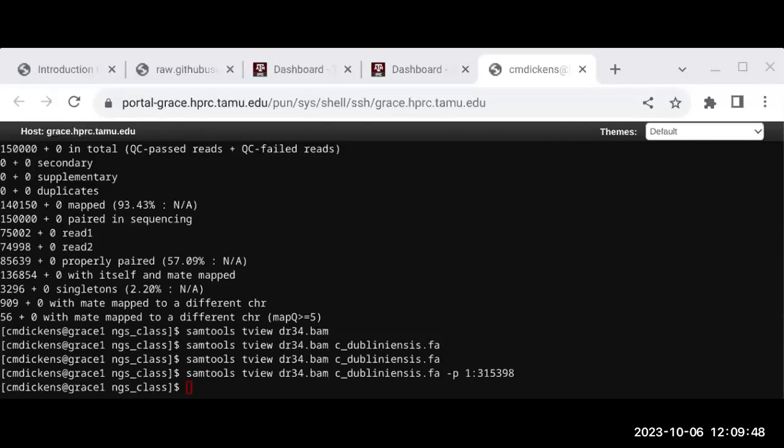All right, this is the last section. This is an exercise to learn how to use containers, and we're going to be able to get through this.